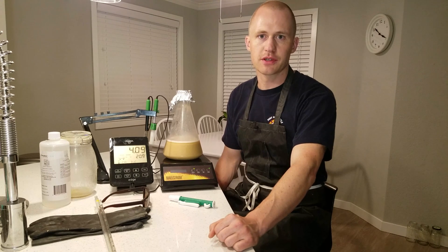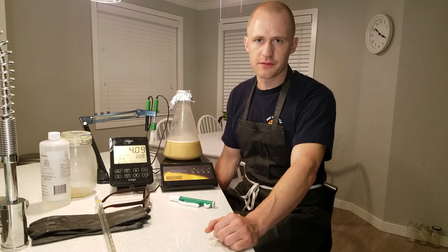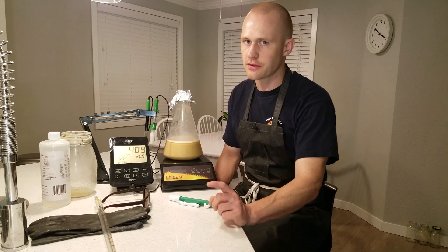Hello and welcome brewers and lab nerds. Today I'm going to show you how to do acid washing of your yeast. This is very different from washing your yeast, so you can go back to that video if that's what you're looking for.